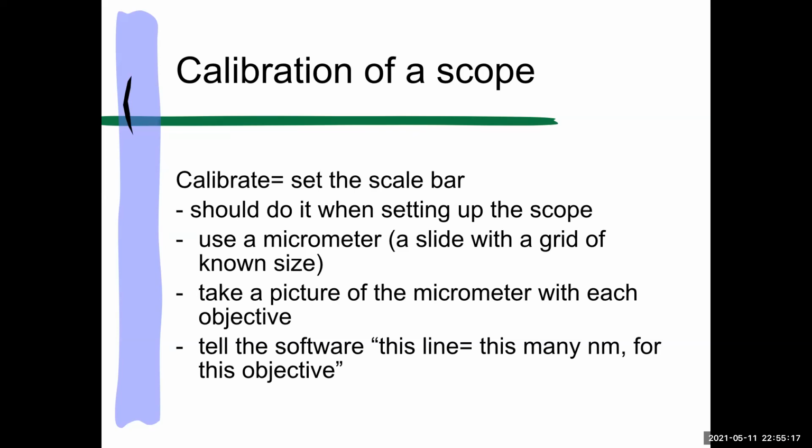You really want to present data with scale bars on them. You don't always want to have a scale bar on your image, because sometimes you're going to crop it or move it or do something different. And the software often burns the scale bar into the image. And then you're sort of like, oh, there, I have to use it. So it's easier to have your final image go back into the software and say, put a scale bar on it now.